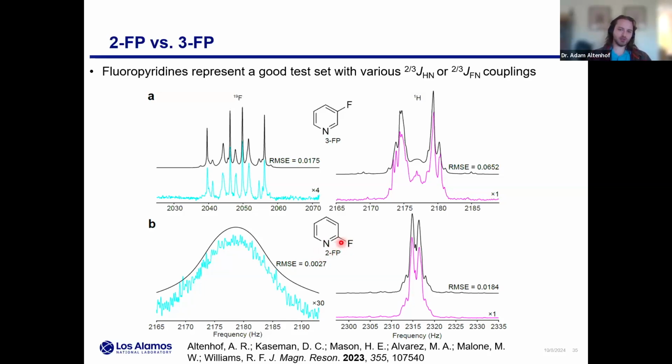And what I'm showing you is the proton signals and the fluorine signals. And what you can see in this case of the 2-fluoropyridine is that the line broadening is very extreme, more like that coalescent regime I described. And what's actually kind of interesting, I have these best fit simulations in each case. I have to include the 14N relaxation to be able to simulate this at all. And by fitting these as a function of that relaxation rate, I've actually now measured the T1 of the 14N just from these 1D spectra, which was kind of cool.